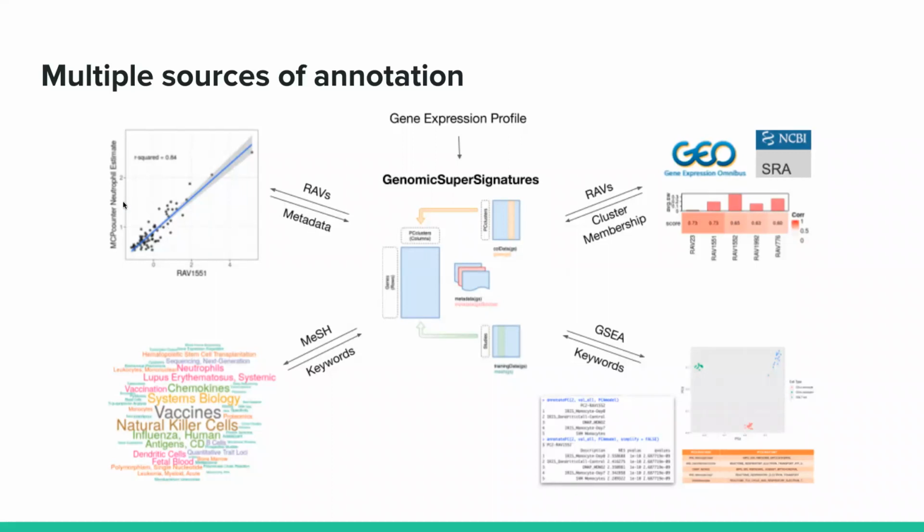So you can search those for things like, this is an example I'll show later, neutrophils, and find axes that are known from their metadata or can be suspected to be related to some metadata attribute of interest. And then this finally is a matching of the principal components of a given data set to the most closely related RAVs from the database.